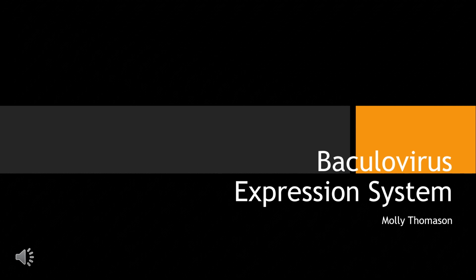Hi, my name is Molly, and this is my video on the baculovirus expression system and how it's used to produce proteins. Some of this information I got from taking the class MIP 613, which some of you might have taken as well, so you will be familiar with this.